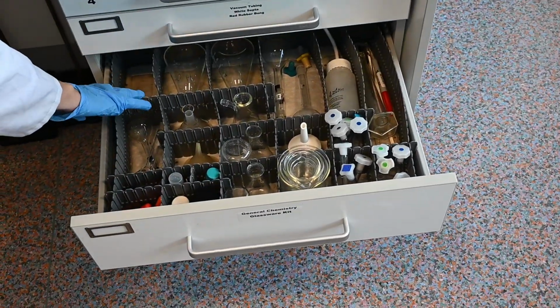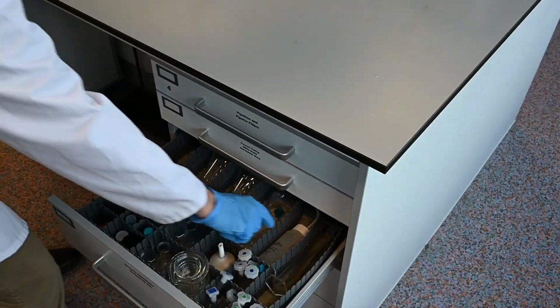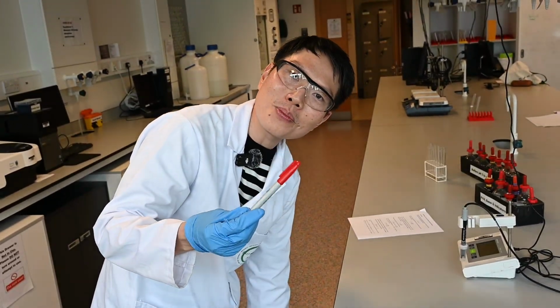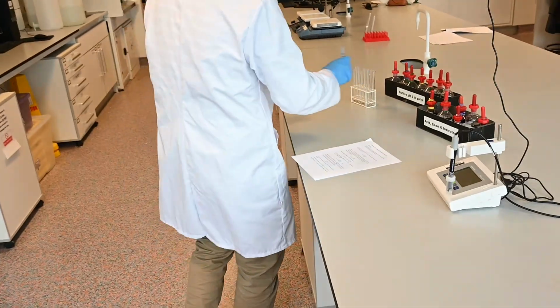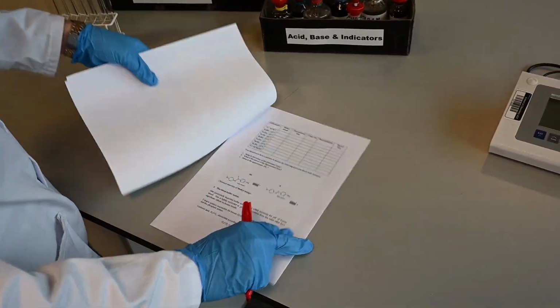I took off the test tube rack and I put it here. Test tubes. Over here, there's a Sharpie, because you need to label what chemicals are going into your test tube. So for instance, let me show you one example, okay, Philip?